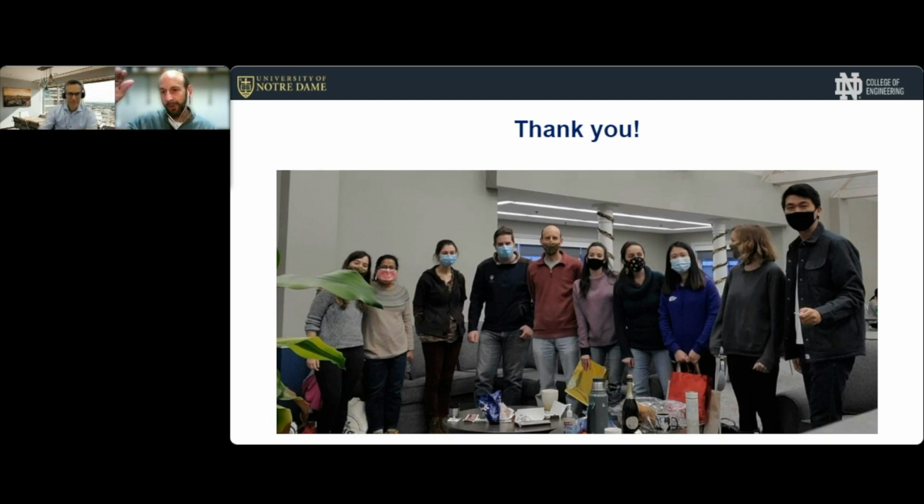You can also scroll through the depth of the biofilm to see what the signal intensities look like when you have the focal plane at different positions, to get an idea if there is actually a drop-off or an increase in the signal intensity. And then maybe you can use that to infer where you are in your biofilm depth with the focal plane.